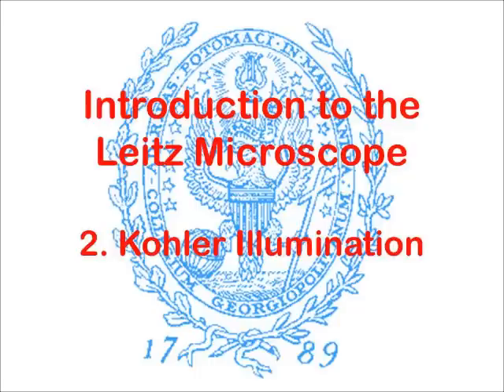But keep in mind that this is only an exercise, and you will not have to do this on a regular basis. I should also mention that this technique will not work with the 4x objective lens on these microscopes, and for this reason you will be only using the 10x objective lens for this exercise.